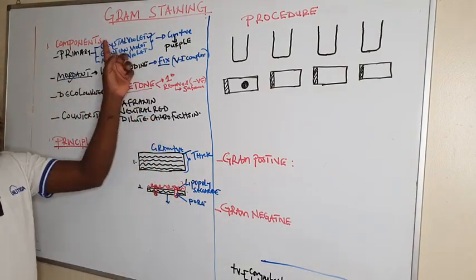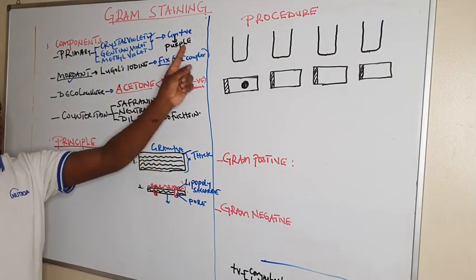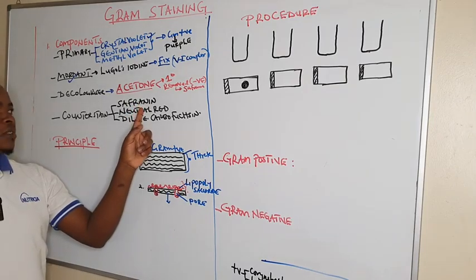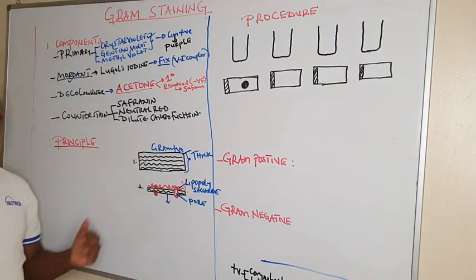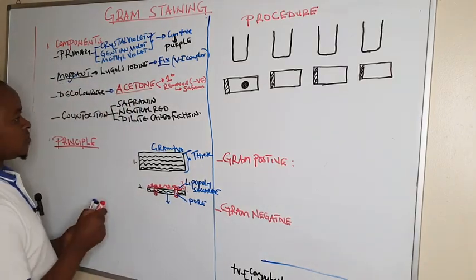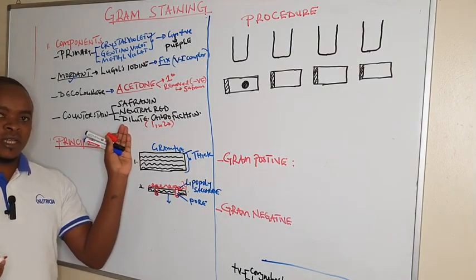The primary stain, we have crystal violet, gentian violet, or methyl violet, which makes the gram-positive organisms look purple after resisting decolorization. Whereas the counter stains, we see safranin being the one of choice, but we can also use neutral red or dilute carbolfuchsin. So you get strong carbolfuchsin and you dilute it 1:20. It is always diluted 1:20, so that you can use it as a counter stain.